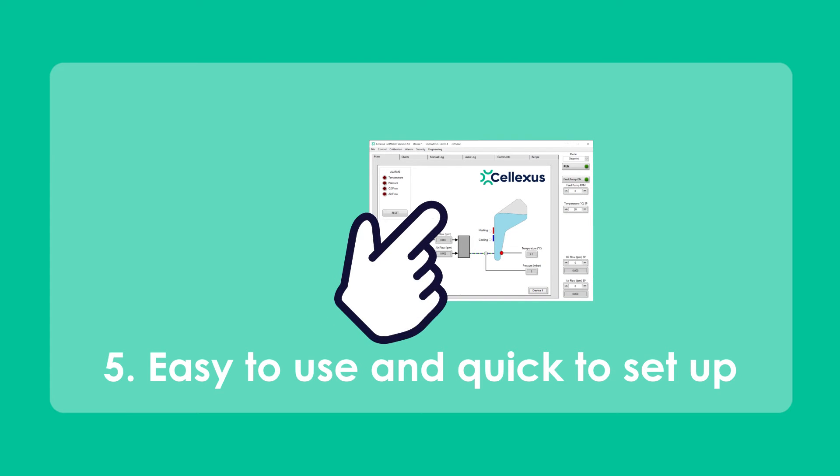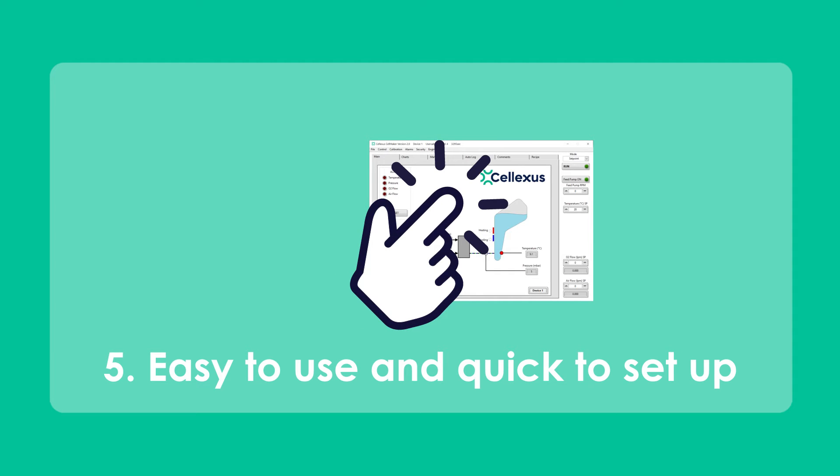The Cellmaker systems are quick to set up, easy to use, and can be operated with a simple touch of the finger.